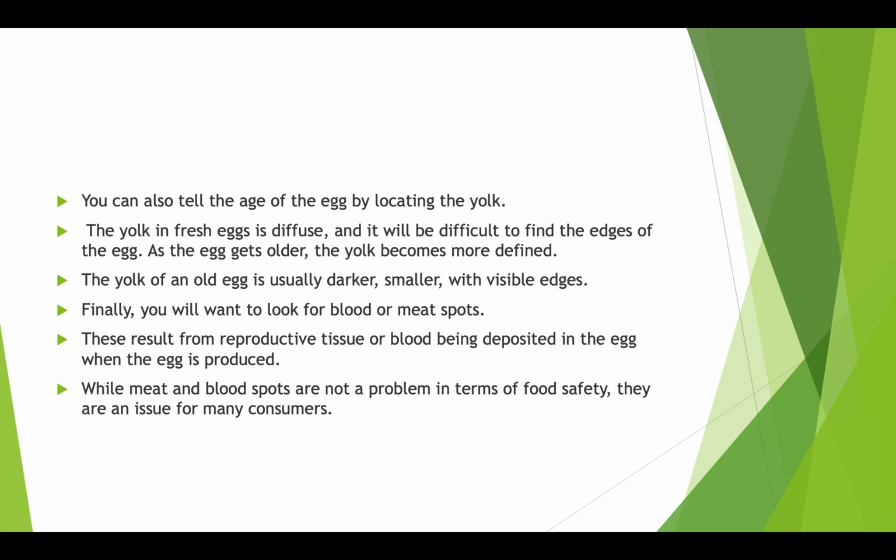Finally, you will want to look for blood and meat spots. These result from reproductive tissues or blood being deposited in the egg when the egg is produced. While meat and blood spots are not a problem in terms of food safety, they are an issue for many consumers.